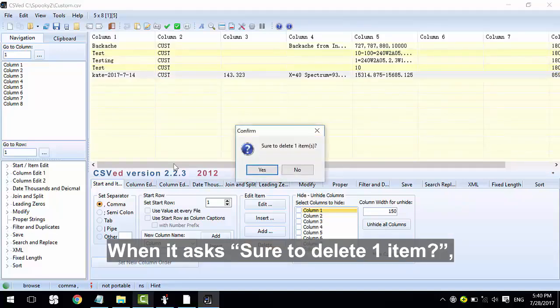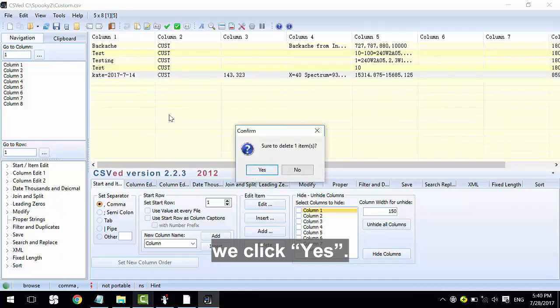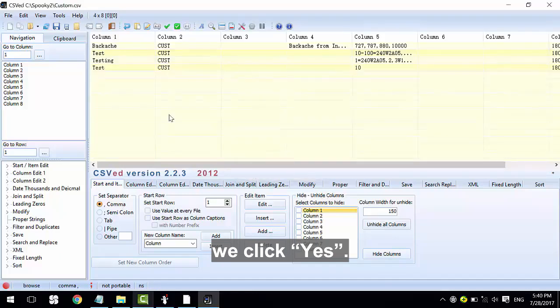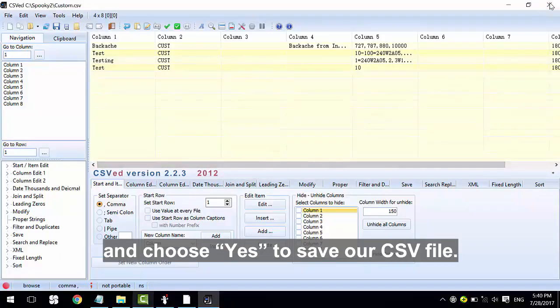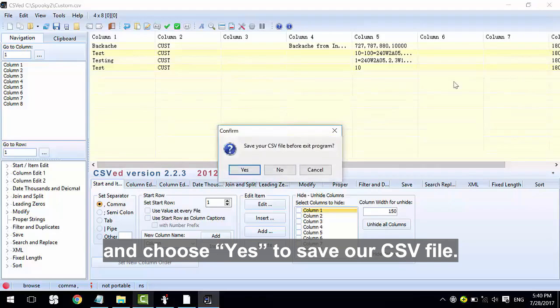When it asks to confirm deletion of one item, we click Yes. We can close this page and choose Yes to save our CSV file.